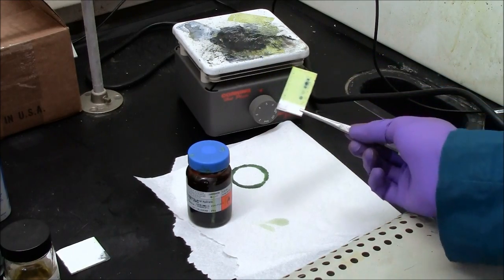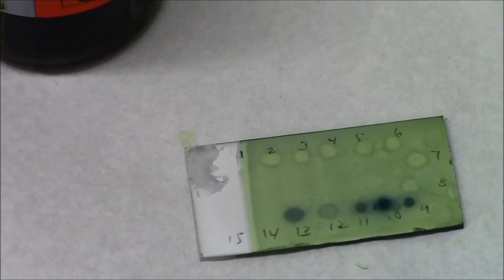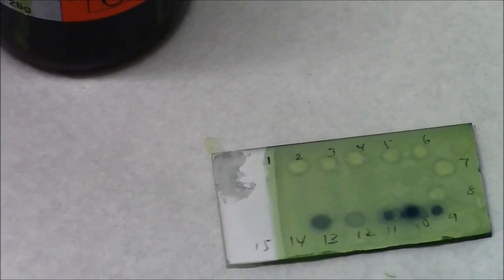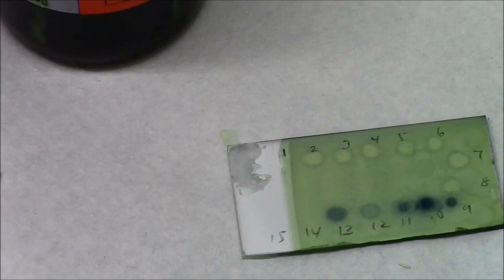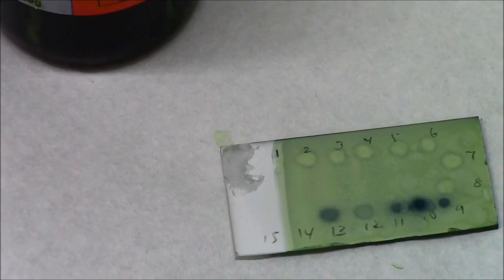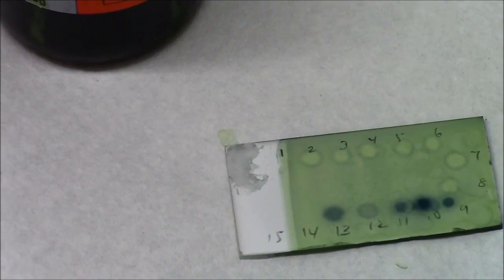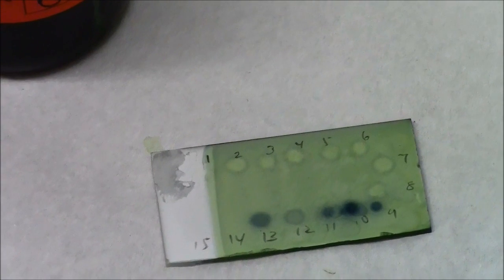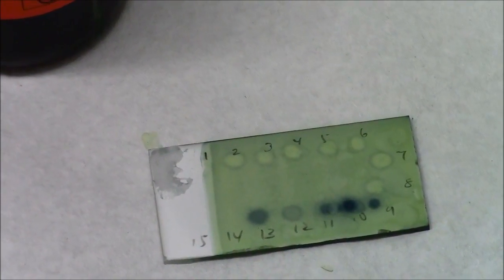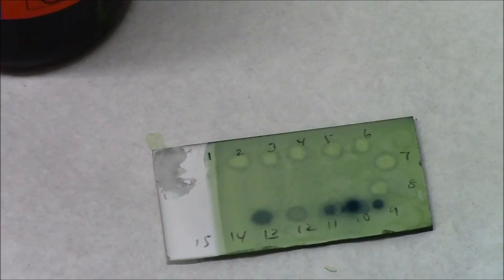Alright, so this is great. I can see that certain fractions have material that's worth investigating. Fractions 1, 2, 3, 4, 5, 6, 7, 8 are useless, but 9, 10, 11 have something of interest, and looks like 13 also has something of interest. So the fractions of interest are worth running on a real TLC plate that I developed to see what molecules these actually are.